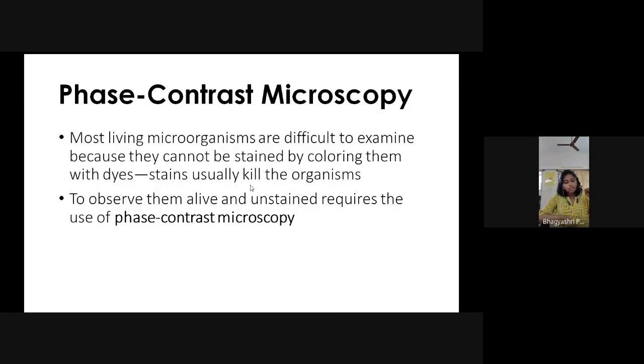So on the negative cell surface of bacteria, if you apply a positive dye such as crystal violet, a bond is formed between the dye molecules and the molecules exposed on the bacterial cell surface, and that is why the bacterial cell surface gets stained. That is the principle of any staining. In negative staining you use the inverse principle. For exactly the same reason you are using an acidic dye, because you do not want to stain the bacterial cells.